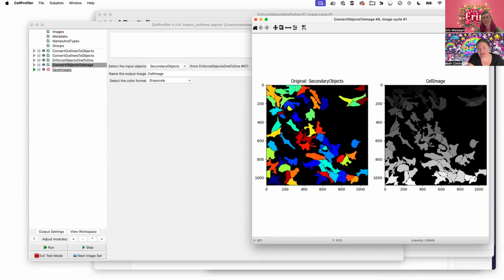To make it be the actual integer numbers, say all the pixels of object 1 are labeled 1, you're going to need the last option. Yes. But so this is 0. The increments here are from 0 to 255 scaled 0 to 1. So that's why we're getting what seems like an odd number, this has a value of 0.618, right? Although it seems like maybe it might just be evenly scaled. I would have to check, but I think it might just be evenly scaled, which means it's going to be a great picture, but not actually helpful for making a label matrix.